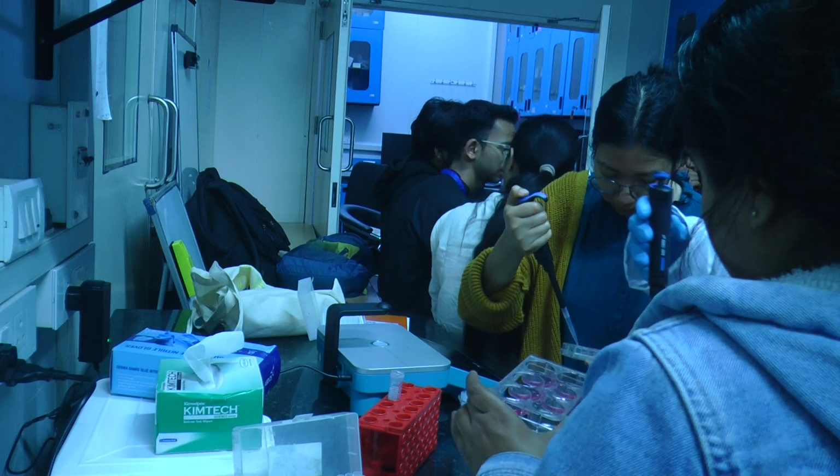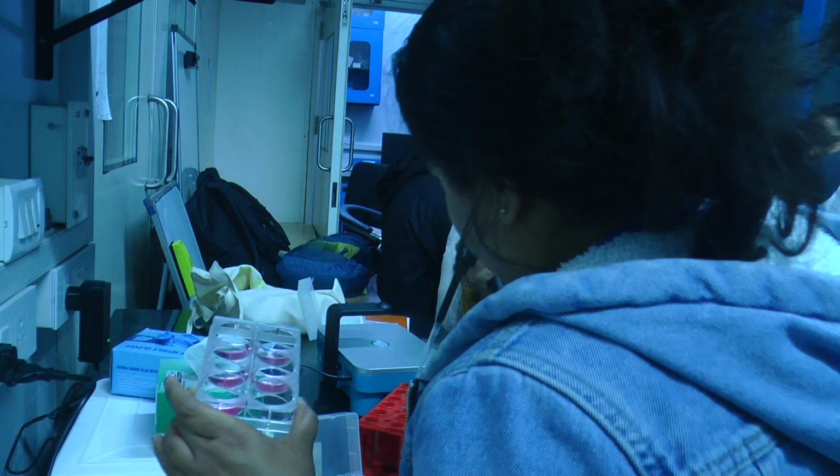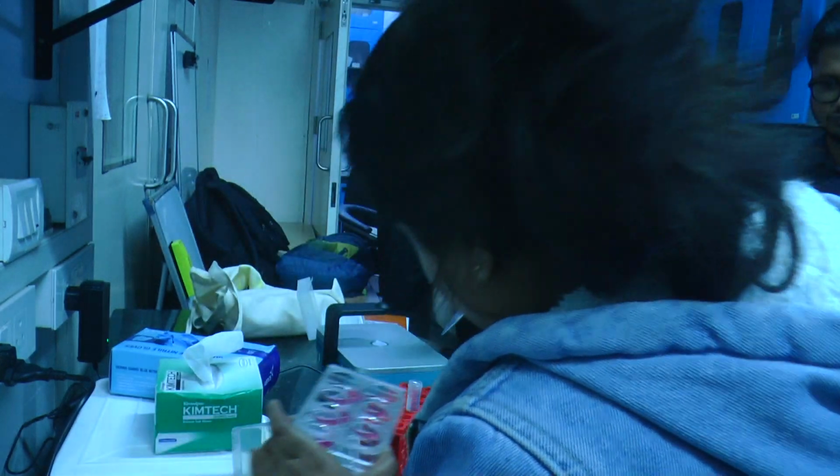You can add 500 like this one, and then add this one.